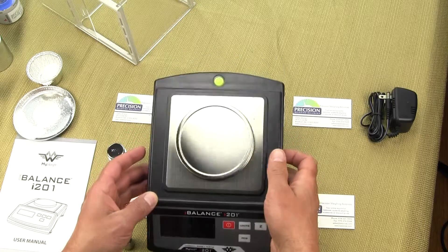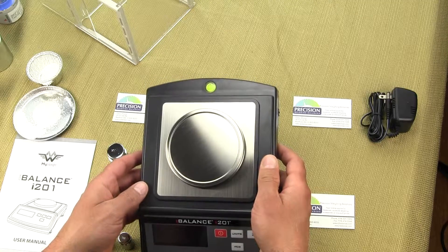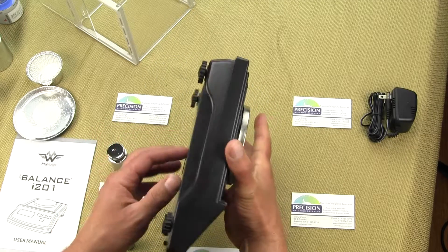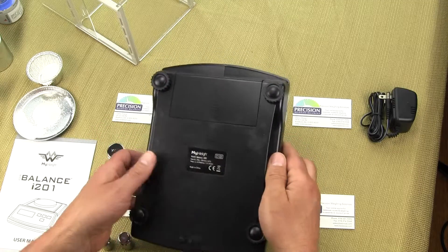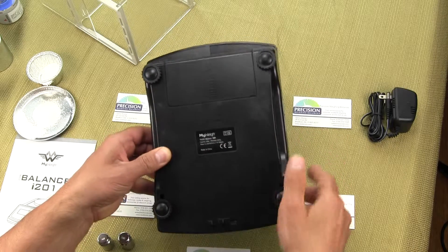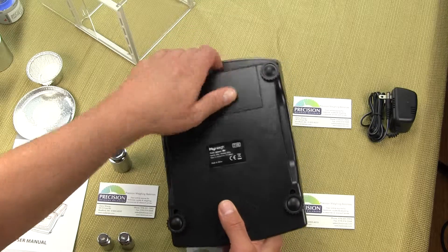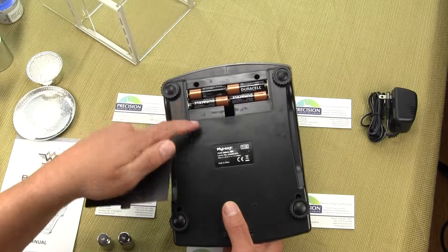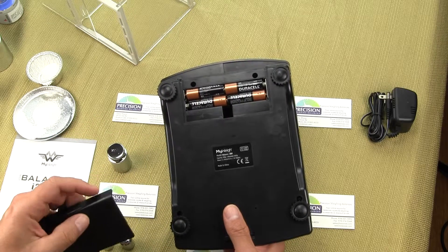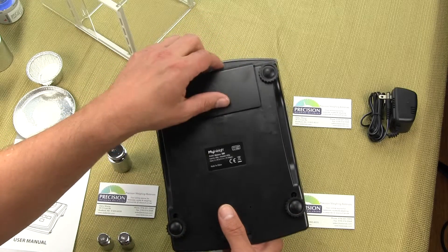On the back of the scale you will see there is a spirit level bubble so you can adjust the balance so it's perfectly level. On the bottom of the scale there are four adjustable feet for leveling. The battery compartment is on the rear. It uses four double-A batteries — on version 1 it was six double-A batteries, now it's only four.